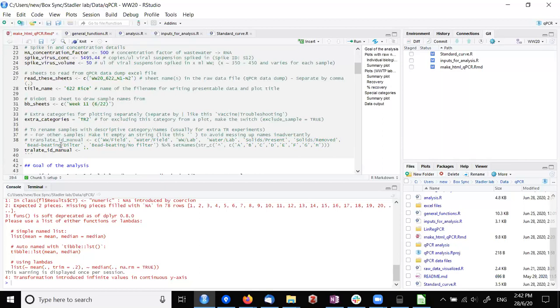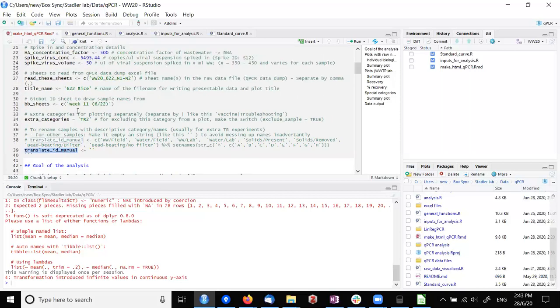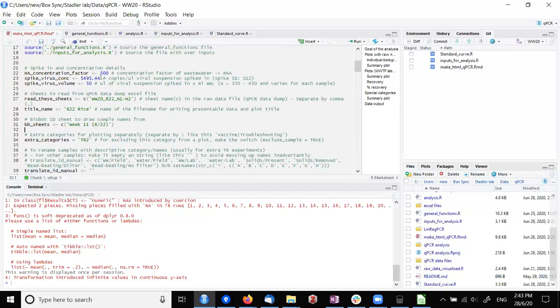Oh yeah. Yeah. If you click on it, it shows other places where the same variable occurs. So that's helpful. So I changed this stuff here. And so we have the vaccine.